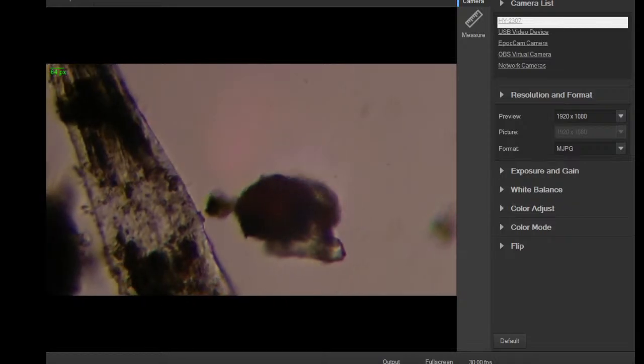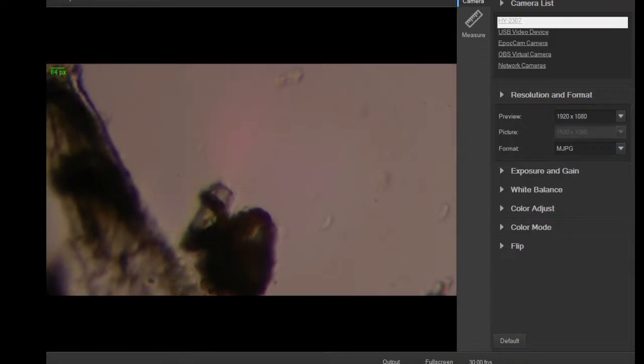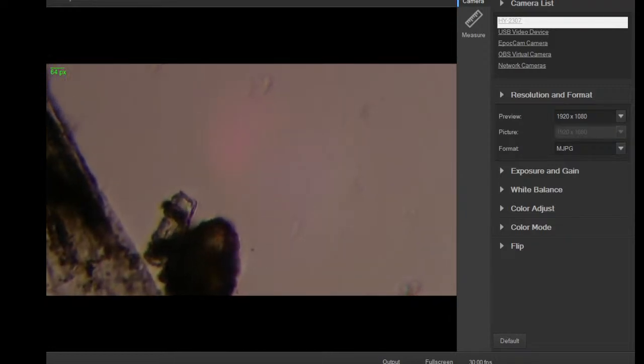Okay. So those are wiggles. Little guys over here again swimming around. Looking for goodies. This is just rainwater collected in a gutter outside the complex here. I should have got it when it was more rainy. I kept forgetting it was starting to dry up. But almost always find something, either in a potted plant or in some standing water.